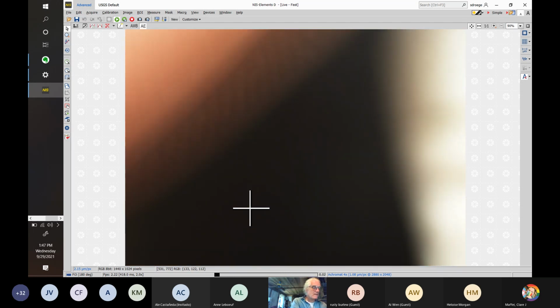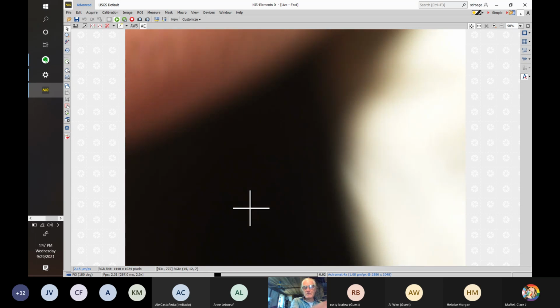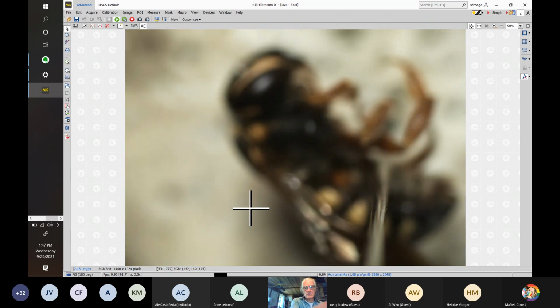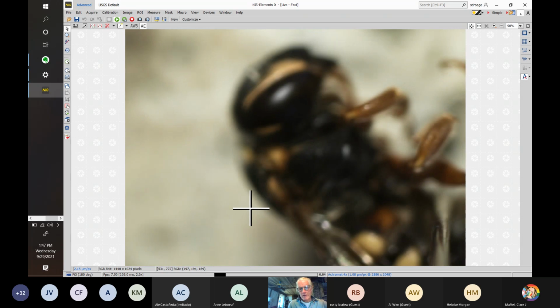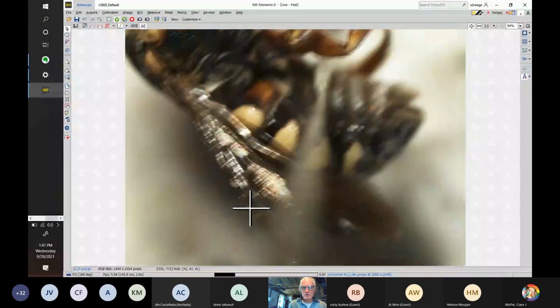other side and get an even better look at the transition between the anterior and posterior side. The males are pretty much going to have the same thing. Or is this a male? Hang on for a second. What's going on down there?